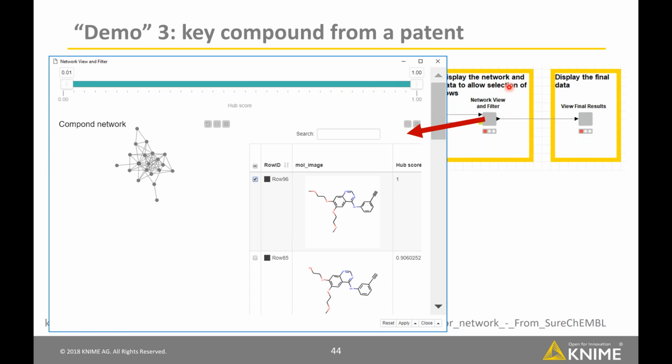There are examples out there of doing that. I've not explored those. Sometime last year, it might have been towards the end of 2016, but I think it was in 2017, there was a publication and blog post from Matt Swain, and other people have looked at figuring out ways to extract data from patents and link it to the compounds. I have not played with that, so aside from mentioning that publication and the software for that, I can't provide more concrete information than that. Thanks. I think I know the publication you're talking about.